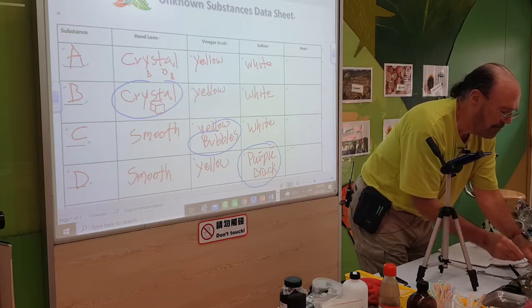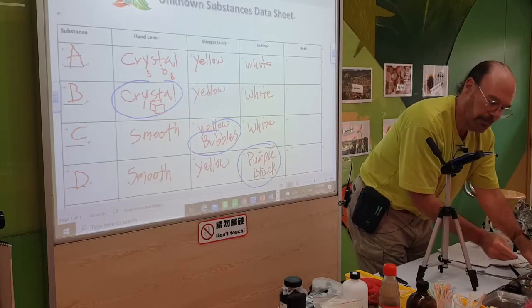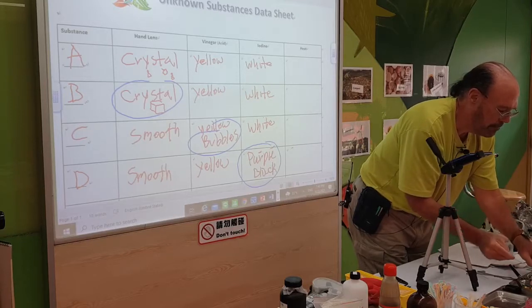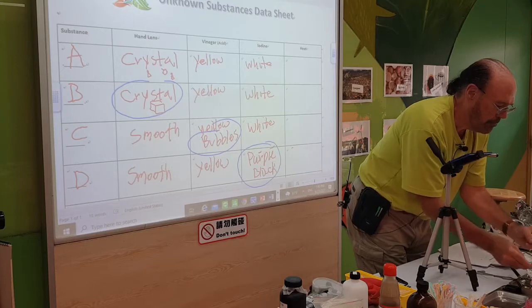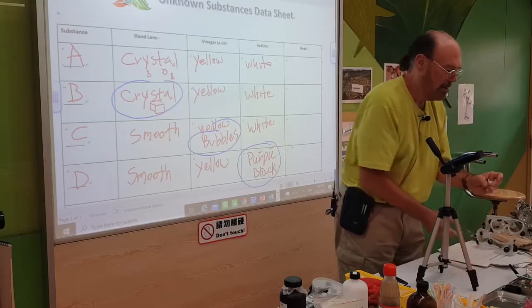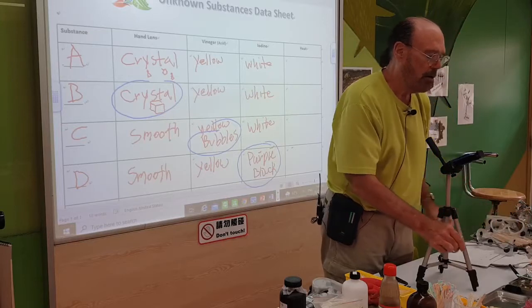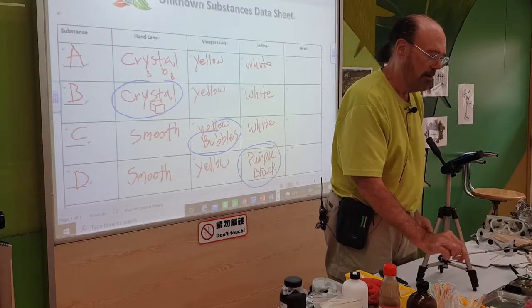And maybe you can tell from a distance. Okay, I'm going to take the tongs and some aluminum foil, and I have A, and I'm going to hold it over the flame and kind of check it out.